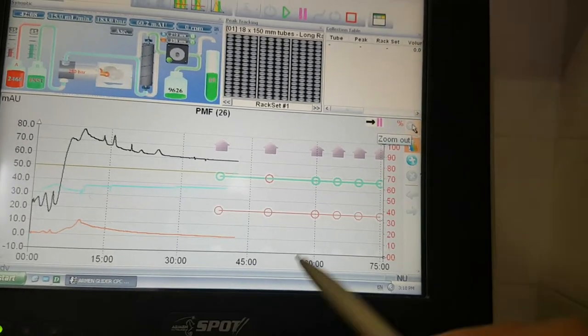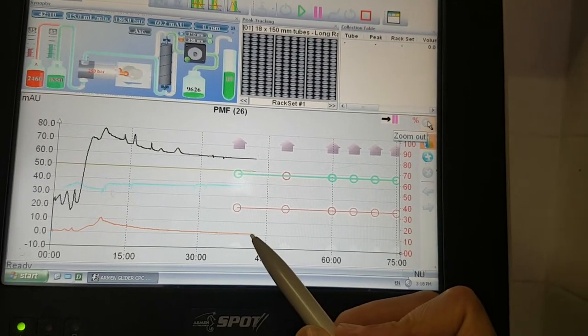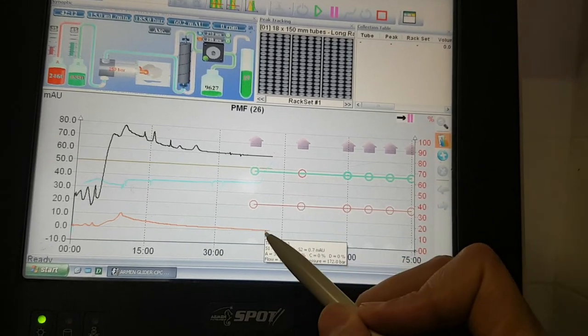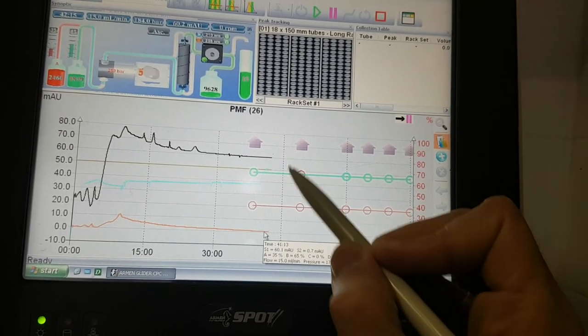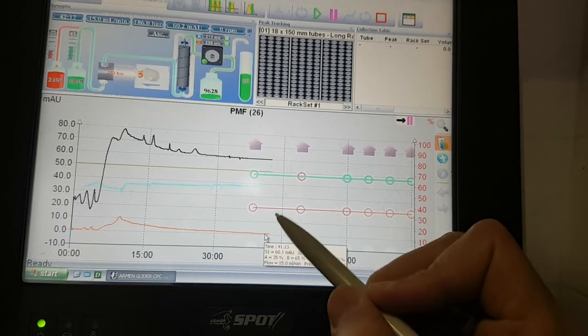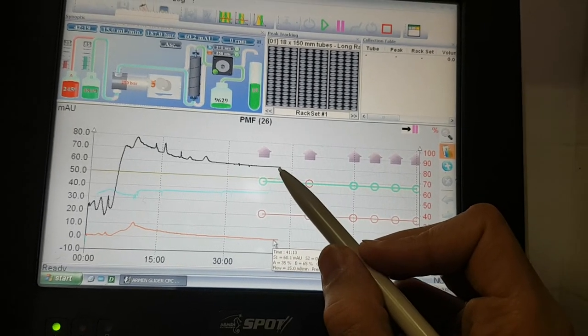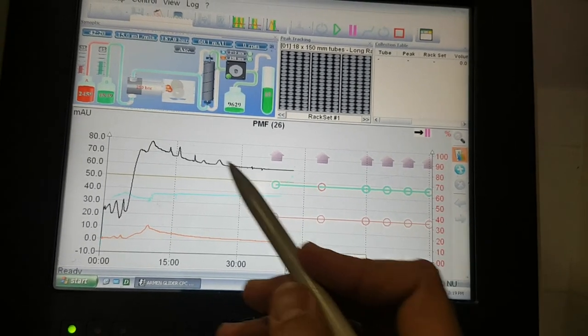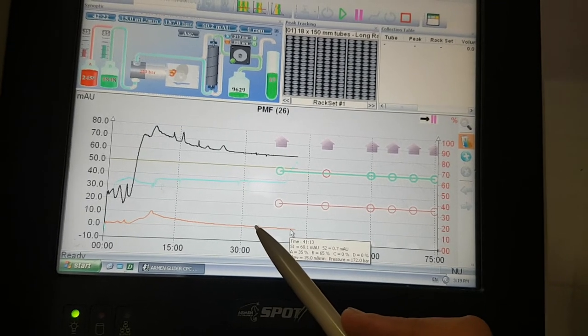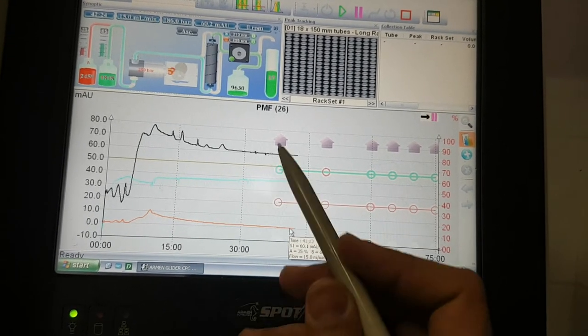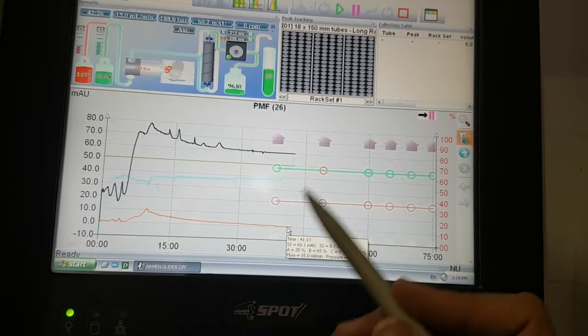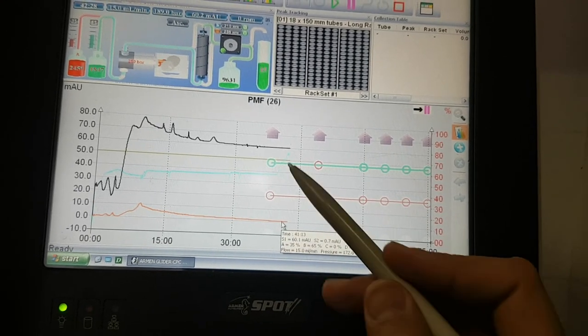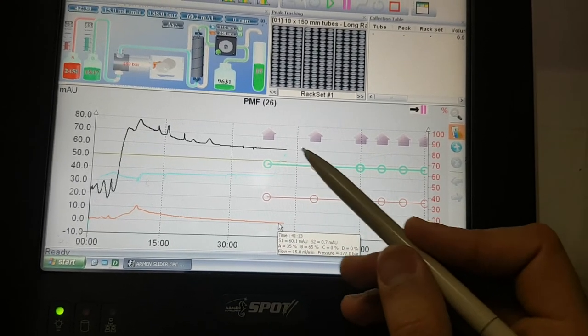The orange and the black wavelengths, they're still the same because all the impurities were removed before. We removed everything. Now the baseline is correct. We can wait only 20 minutes.